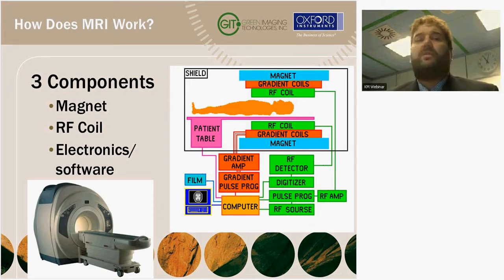I won't spend a lot of time describing NMR, even though the talk says the basics of NMR. By basics, I'm just going to cover a few things that you need to understand in order to help understand how NMR can apply to NMR logs and NMR core analysis.